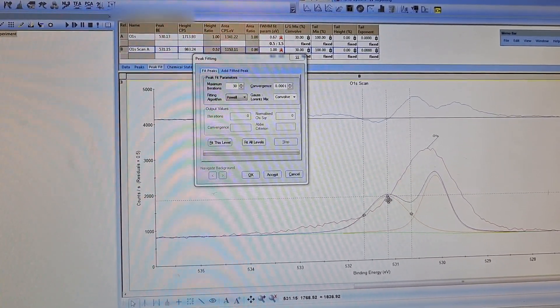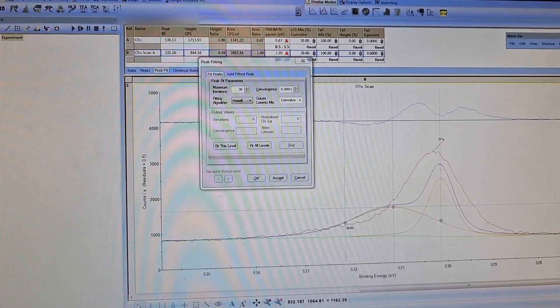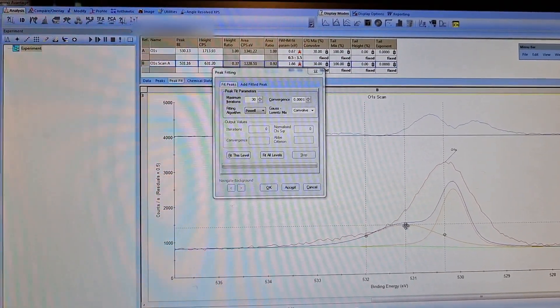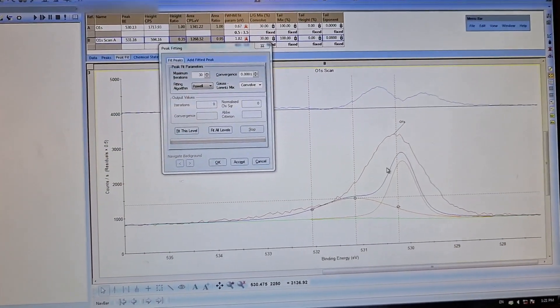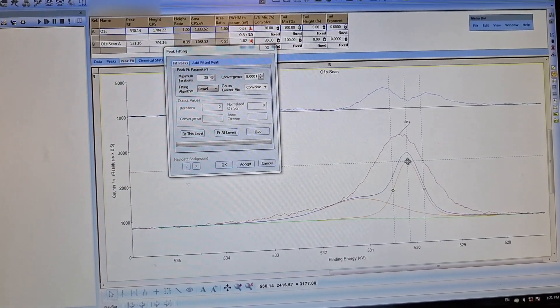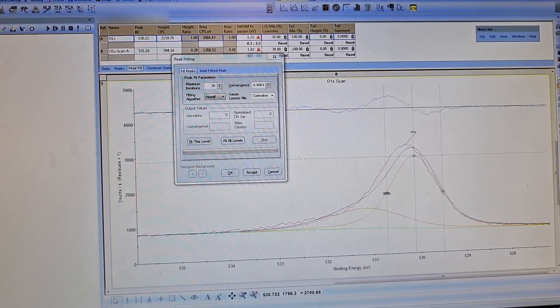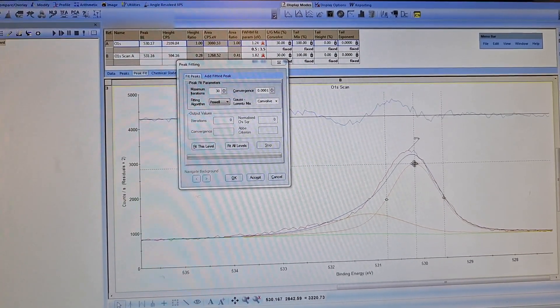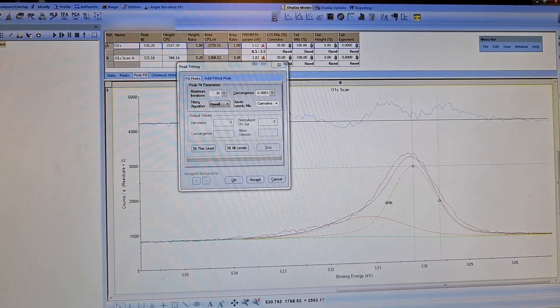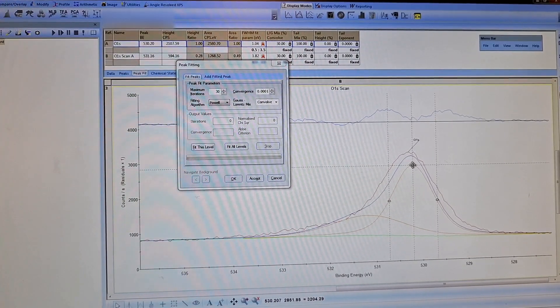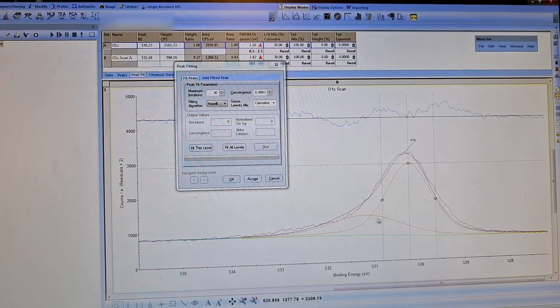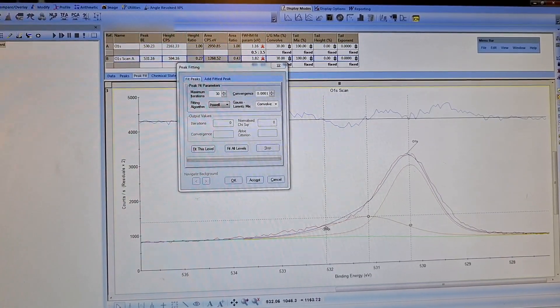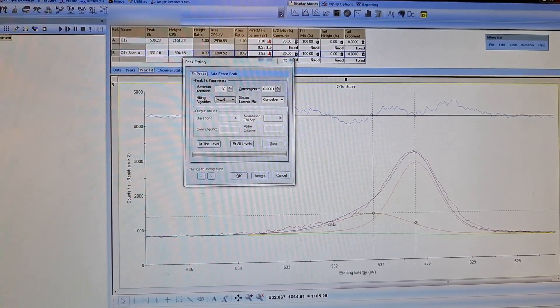One of the fitted peaks should be around here, I think, and the other should be around here. This is a very rough peak fitting. It's not like Casa XPS, but it is still useful.